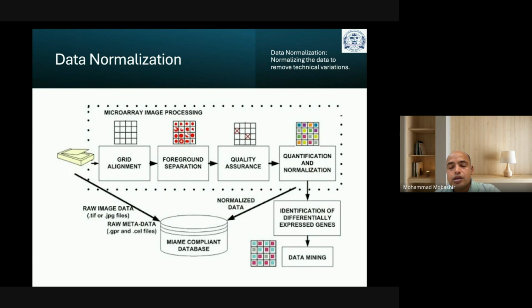Then download the library files from the main source website or also some other software pipelines, and extract the probes and probe intensities. Then go for normalization, where you could use GCRMA, RMA, or EB approaches. So this is what you could understand.